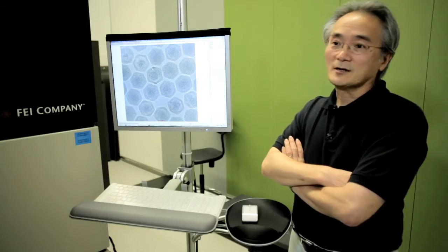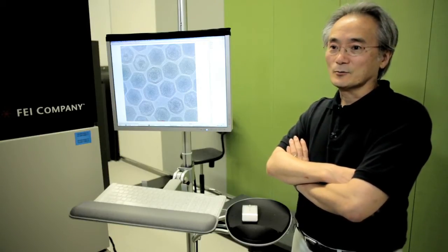With this microscope, she wants to determine not only the structure of the virus, but we just got a Tier 3 award from the government to study how the dengue virus assembles.